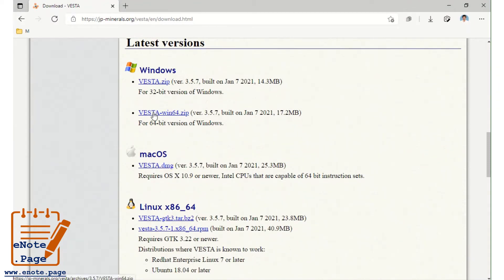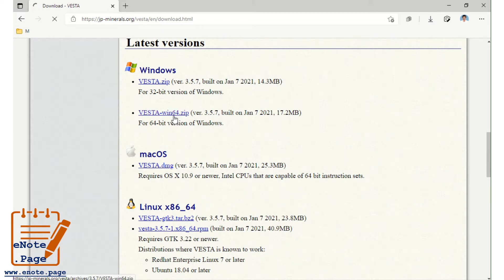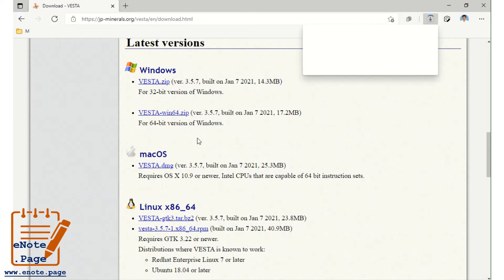I am going to download for Windows 64-bit. It's a zip file, so we have to unzip it and then use it. The current version is 3.5.7. After unzipping, we can use the program.